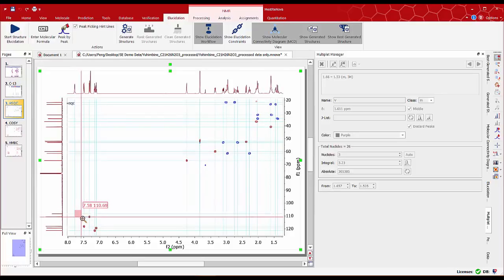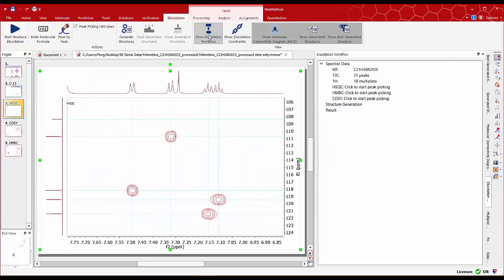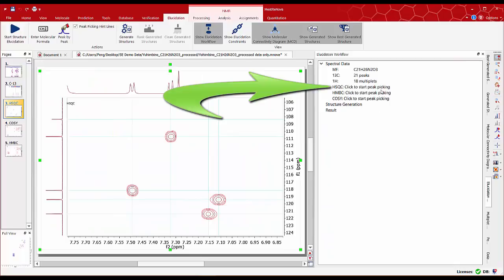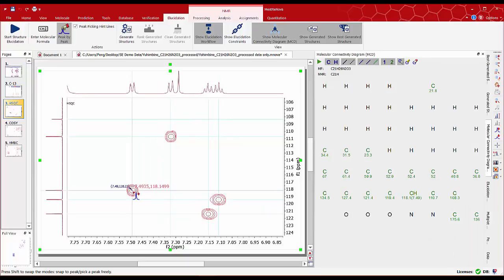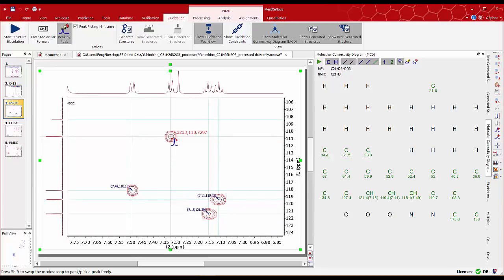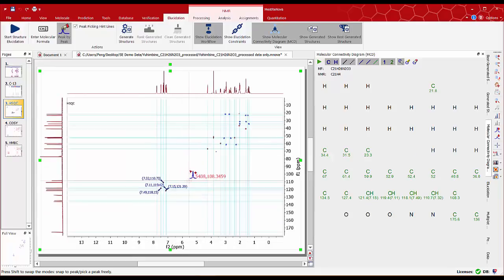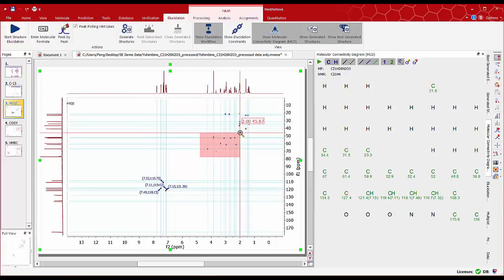Next step in the elucidation workflow is to select HSQC start peak picking. The cursor automatically changes to peak by peak mode. We can start doing peak picking on the spectrum. Similarly we can do the same for other regions of the spectrum.